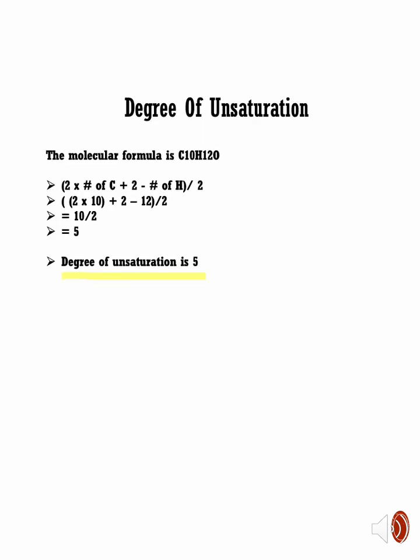The CH ratio is very similar, which is indicative of unsaturated carbons, likely from an aromatic structure or just multiple double bonds. Now, we want to look at the degree of unsaturation, which will tell us the number of double bonds in this molecule.